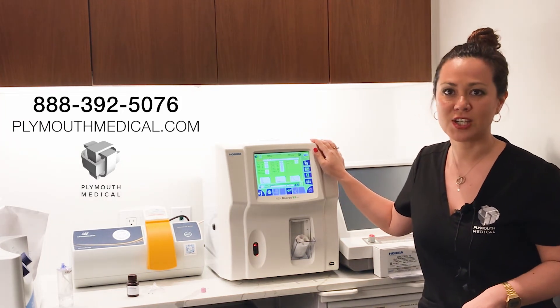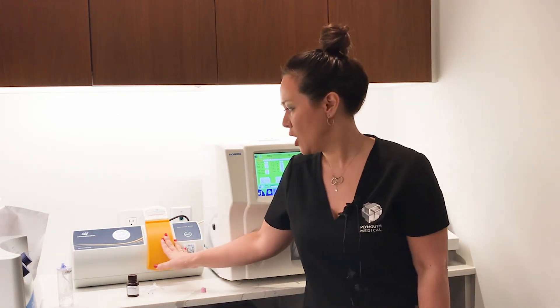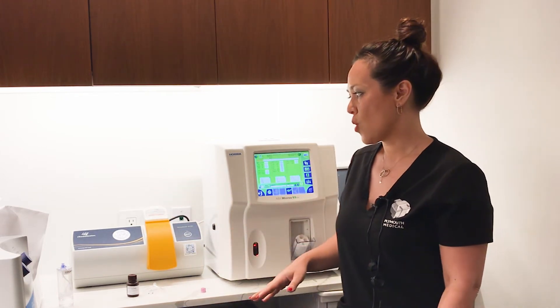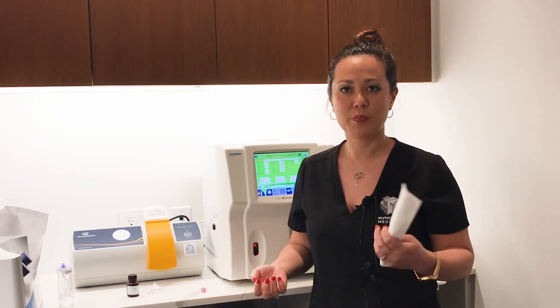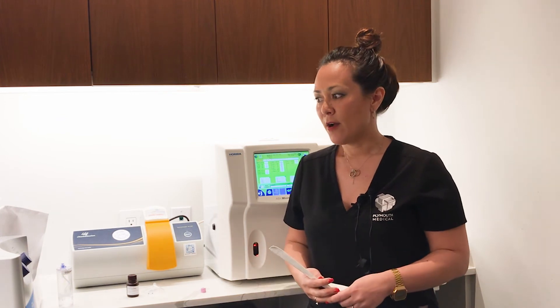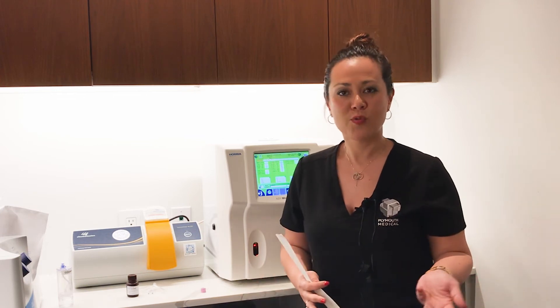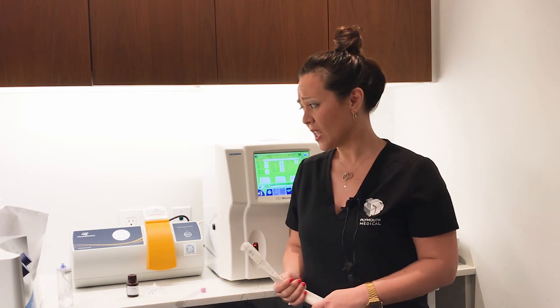We're also going to do further videos on our total nucleated cell counter, which is the Chemimetic NC200 — it's a completely different device that will quantify nucleated cells. It's a very gross measure of the stemness of your baseline bone marrow and your bone marrow concentrate. Bone marrow concentrate is the only stem cell treatment in orthobiologics that is on the right side of regulation and also has the only level of data.